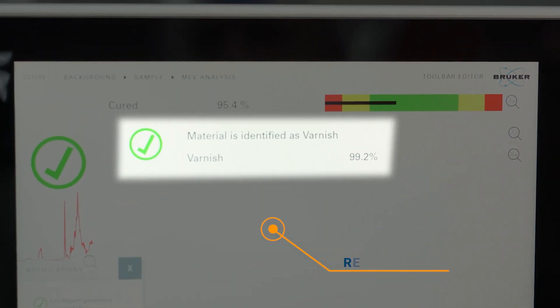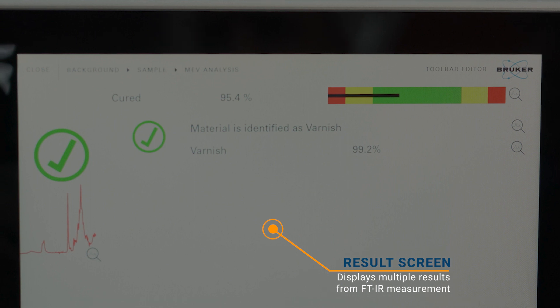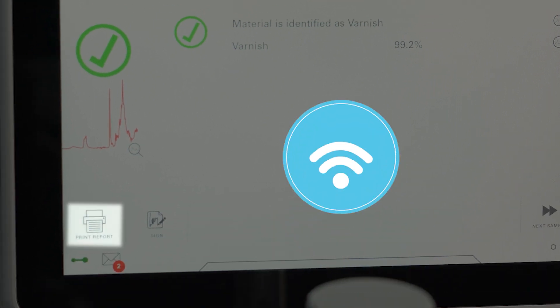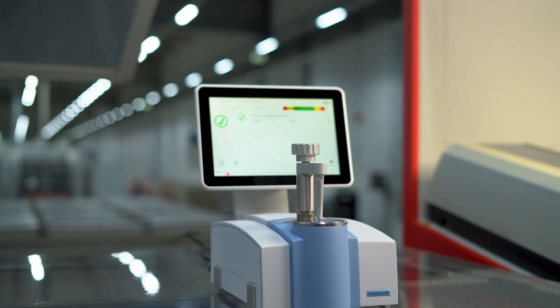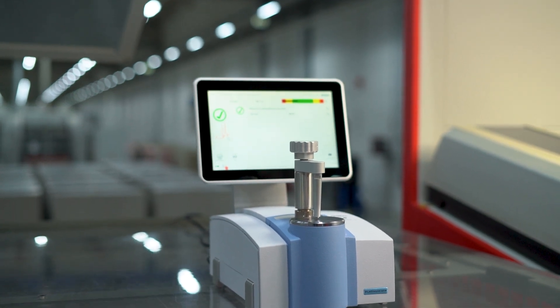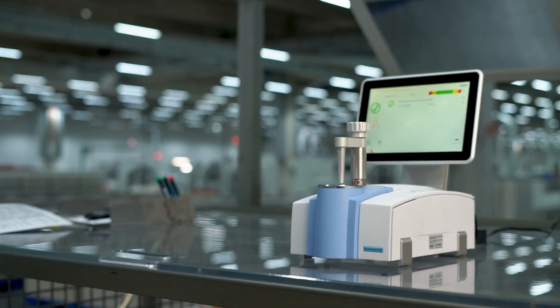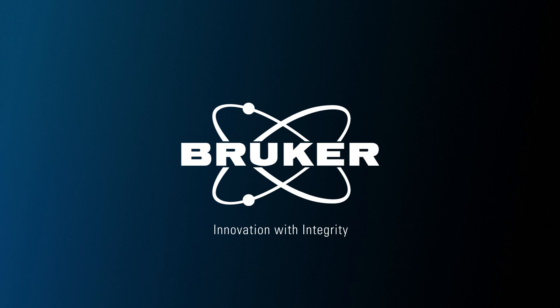It shows both the varnish used and its degree of curing. Subsequently, the results can be exported as a PDF report and automatically sent via Wi-Fi to the Sure Data server or by email. Sure Pack Germany is currently working on further development of this process in order to increase printing speed and thus produce more sustainably while maintaining the same production reliability.